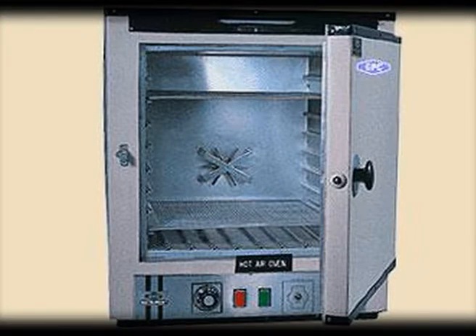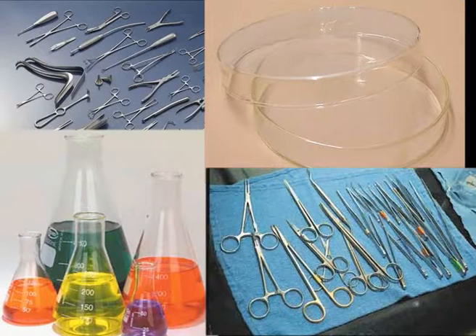So the things that can be sterilized in a hot air oven should be dry in nature, like glassware, surgical instruments, petri dishes and conical flasks. These can be sterilized properly in hot air ovens.